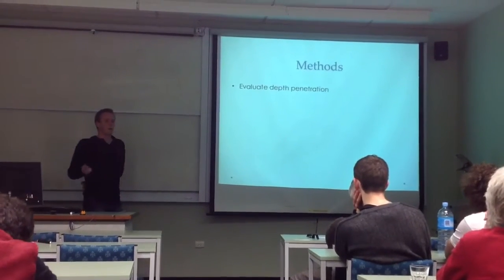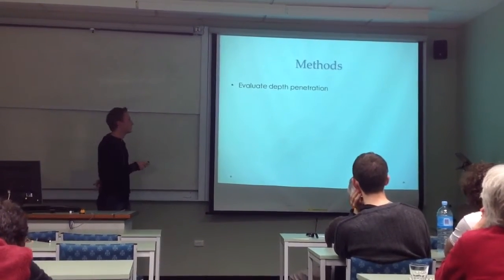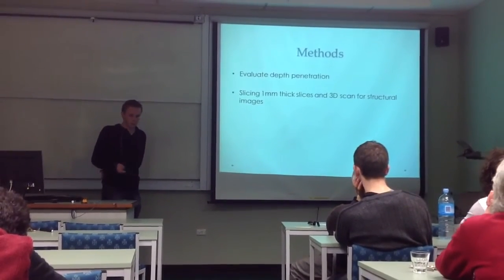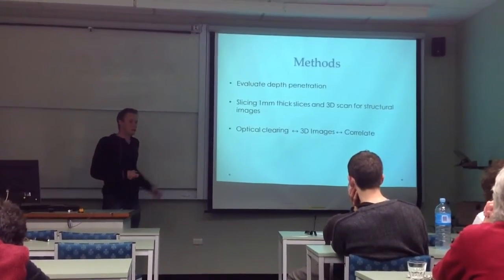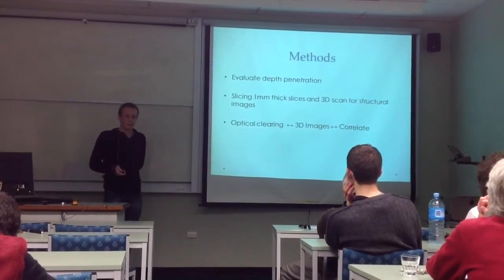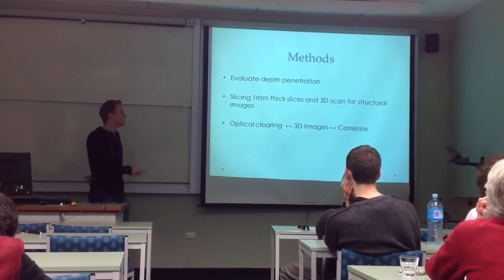Okay, so back to my three methods points. I'm going to evaluate the penetration depth, then I'm going to slice the tissue up to get more structural information, and then I'm going to use this hybrid cross-correlation optical clearing technique to try and get even more structural information.